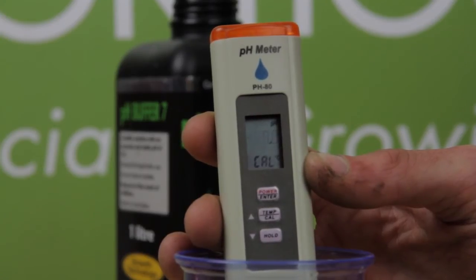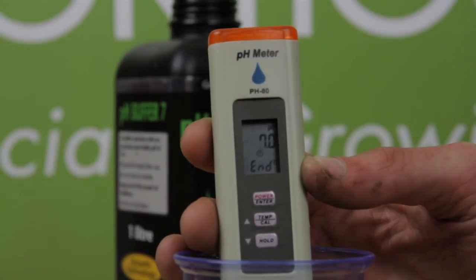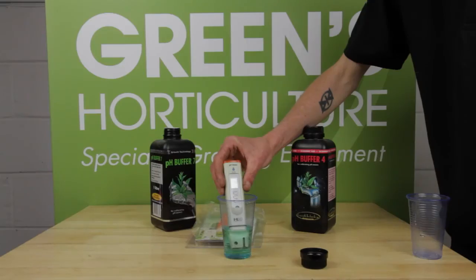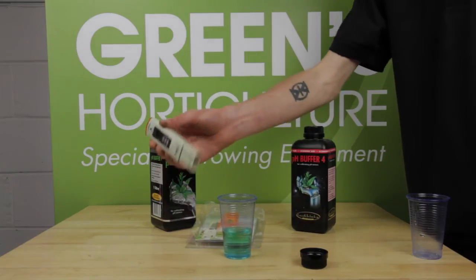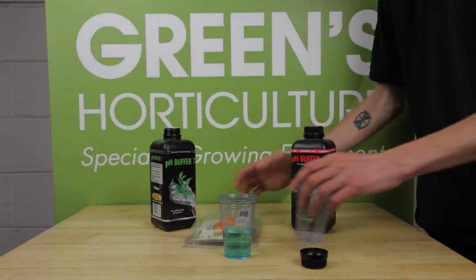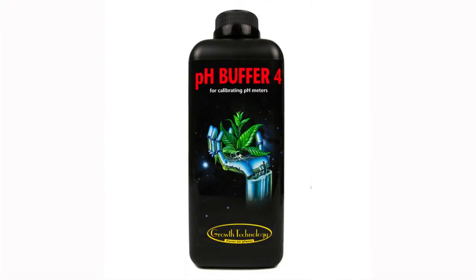The CAL text begins to roll sequentially — the pen is now calibrating itself to the pH 7 solution. This can take up to one minute. The rolling text changes from CAL to flashing END when the process is complete. Your pen is now calibrated.